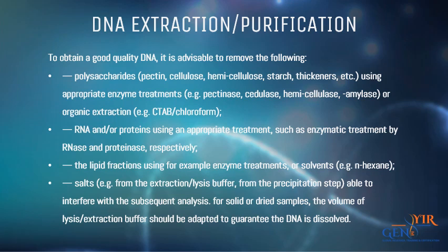Polysaccharides, pectin, cellulose, hemicellulose, starch, thickeners, etc., using appropriate enzyme treatments, for example pectinase, cellulase, hemicellulase, amylase, or organic extraction, for example CTAB or chloroform. RNA and proteins using an appropriate treatment, such as enzymatic treatment by ribonuclease and proteinase, respectively.